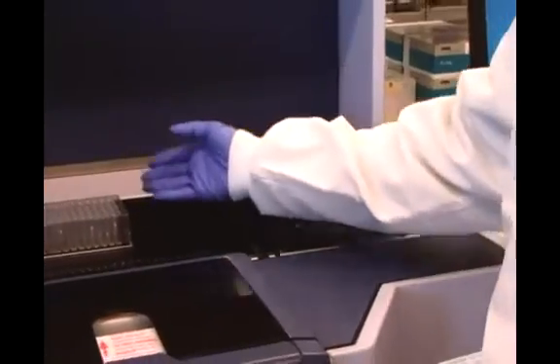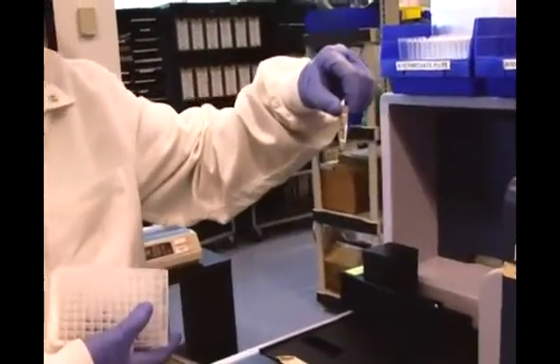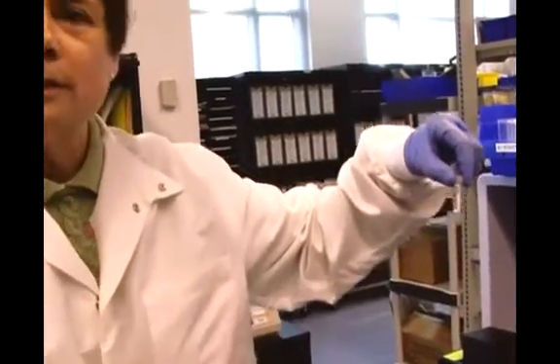we actually rotate the plate like so. And then it's going to come back over, and it's going to pipette 24 donors into one of these tubes. So we call it a Sarsted tube. So this one little tube here represents 24 donors, that's why it's called pooling.